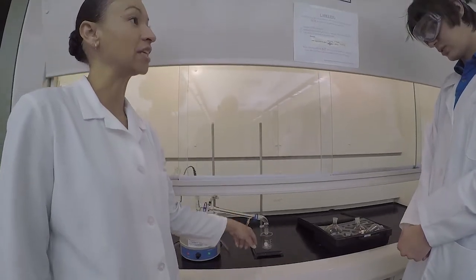Disposal. Dun dun dun! When you are finished with chemicals or chemical reactions, you must dispose of the waste. But how, you may be wondering? The biggest thing to remember is to always check with your professor before disposal, and never assume waste can go down the drain or in the trash.